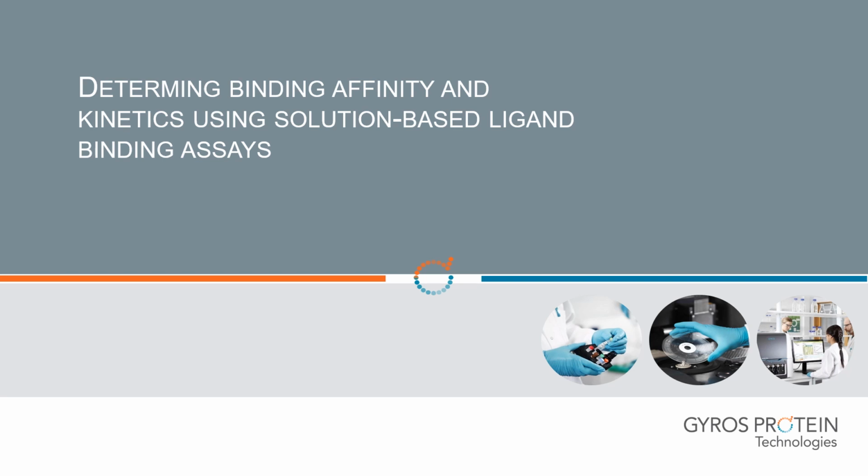Today on the podcast, we're going to talk about determining binding affinity and kinetics using the solution-based ligand binding assays on the Gyrolab system. Yeah, really going to highlight how the Gyrolab platform can be used to calculate KD and used for affinity determination. So I think it's a very versatile functionality, and we're finding it can be very useful for our customers to have this option to use this part of the software.